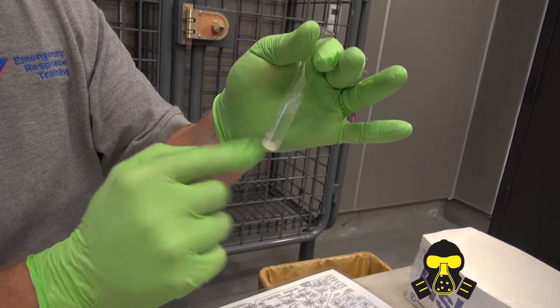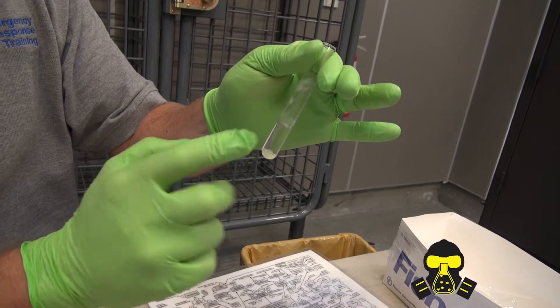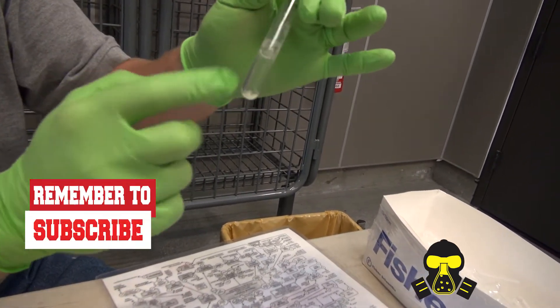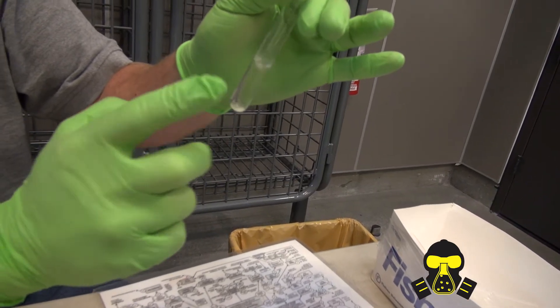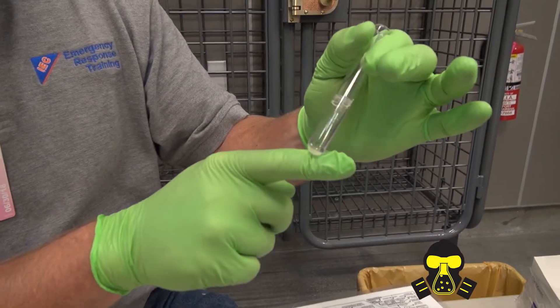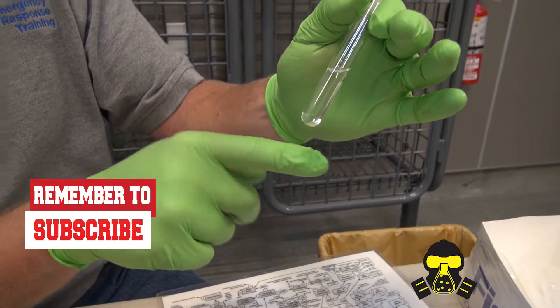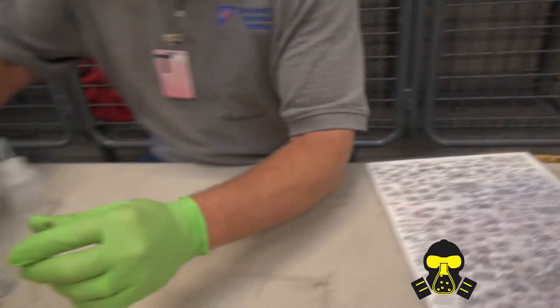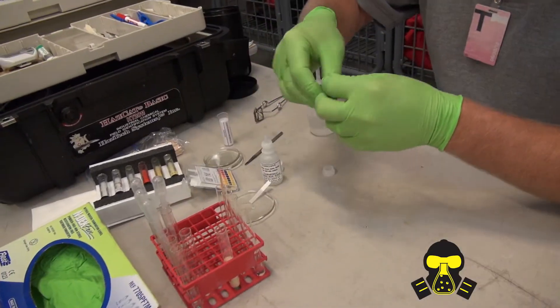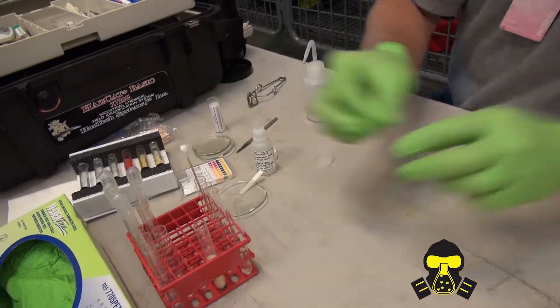We're going to see if it dissolves. Put more water in there than I needed to. It's dissolving slowly. It is dissolving — there is less in there than when I started. I'll check the pH of this material. If you give me an acid or a base — neutral. Good to go from there.